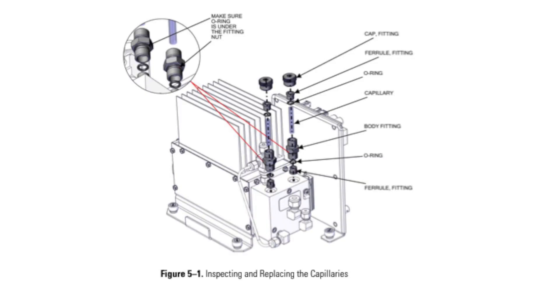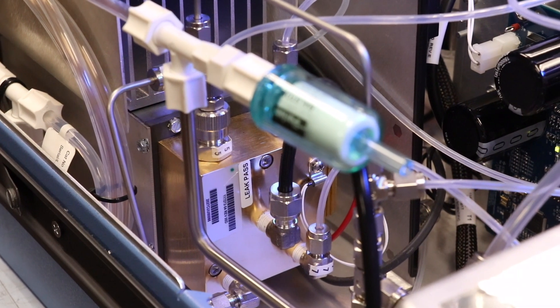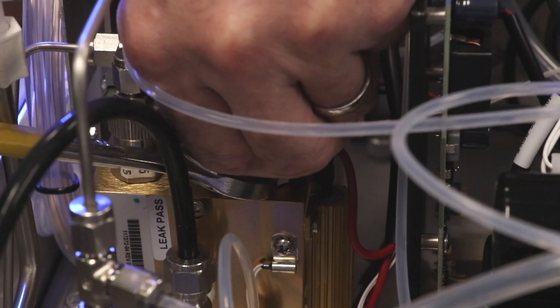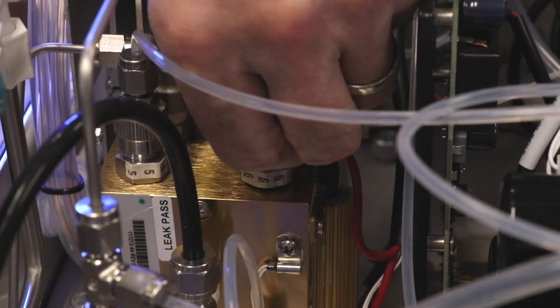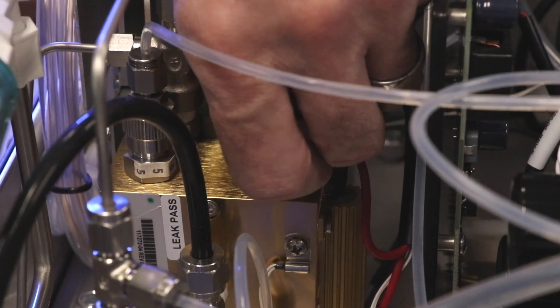Before beginning the capillary inspection and replacement, refer to figure 5-1 in the manual for an exploded view of the capillaries, fittings, and O-rings. Begin by turning off the analyzer, unplug the power cord, and remove the cover. Remove the fittings from the reaction chamber by using a 5-8 inch wrench, being careful not to lose the ferrule or O-ring.